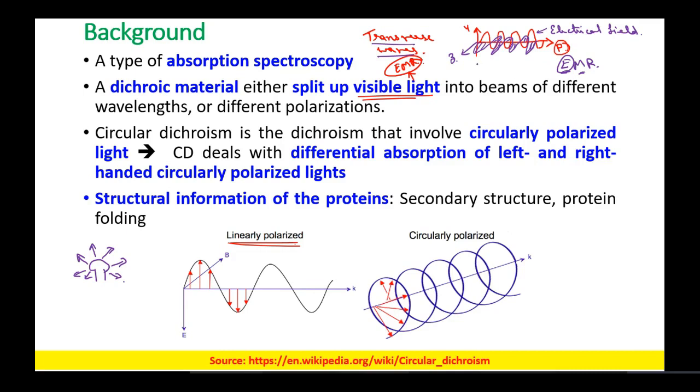So herein, as I told you, the electrical field moves in a sinusoidal wave. Now from the opposite side of this propagation direction, you will see that from the basal level, which is the zero level, the amplitude is increasing and also decreasing.